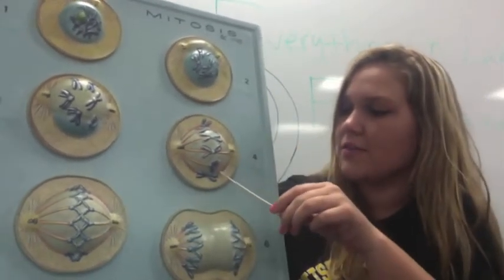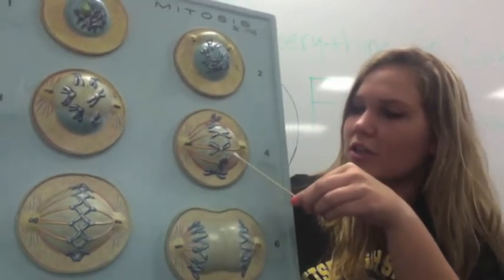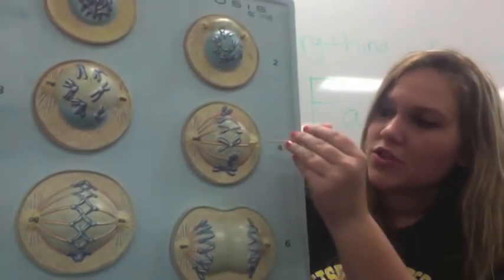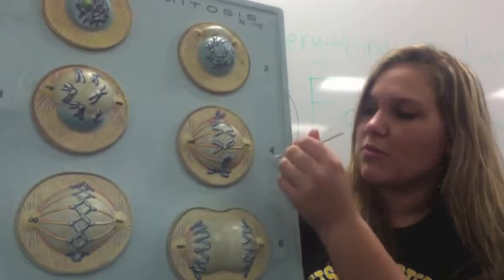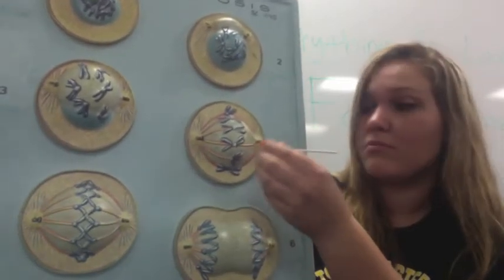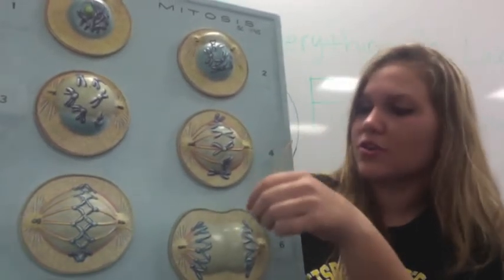Now, the next phase is metaphase, and these orange things right here are called spindle fibers, and they attach to the chromosomes to start pulling them apart. So the way that you can remember metaphase is move—metaphase, move—the chromosomes are attached, and they're starting to move.